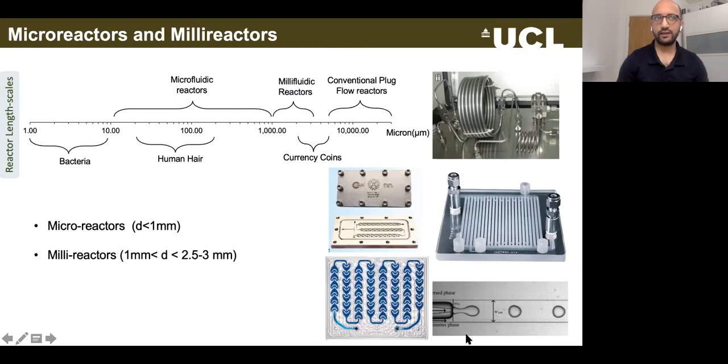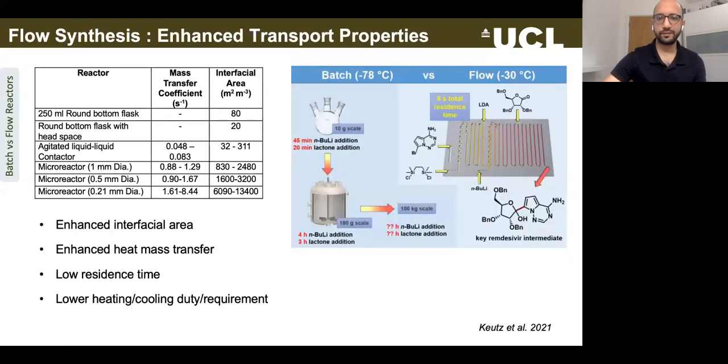The microreactors are a little different from conventional flow reactors because of their size. Here we see the conventional plug flow reactors, which are a little bit bigger, and microreactors, a little bit smaller than the conventional flow reactors. That is something very important to remember. So why do we use microreactors?